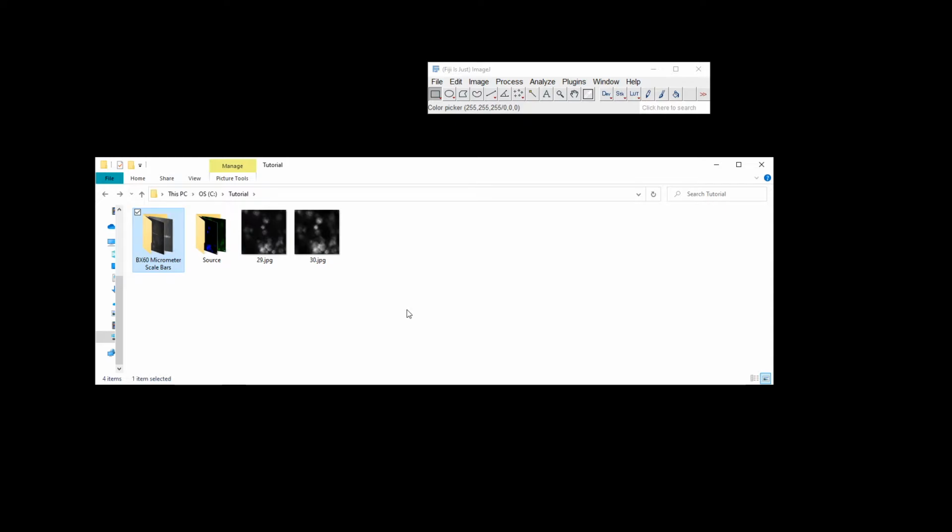So with that, you would also need your images. The email that I sent out yesterday outlines the instructions for the results section. So I would suggest organizing your image files, selecting the ones that you're going to pick for your figures, and having an organized system based on the legend that you and your partner have agreed upon.